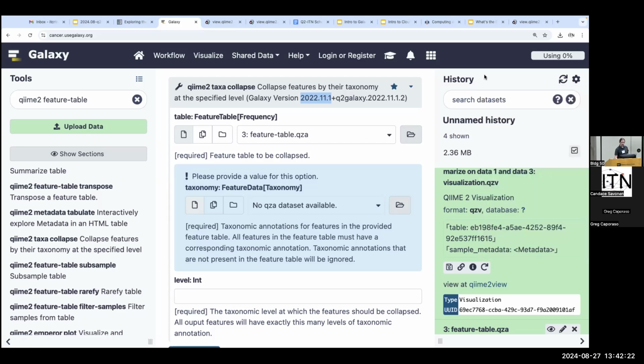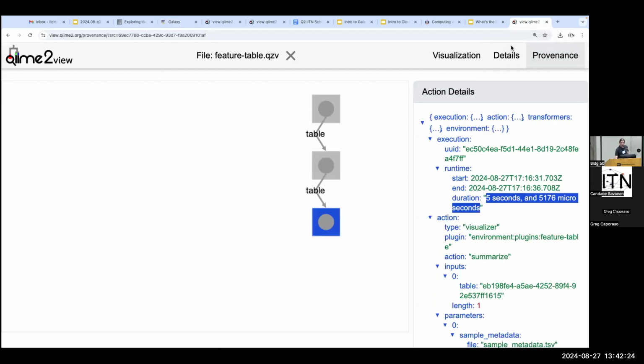The way that we typically do this with QIIME2 is we have another tool. We're going to show this to you at the end of the day on Friday. We have a tool that's built into QIIME that enables you to generate what we call a reproducibility supplement. It's basically going to create a zip file for you that has all of the commands that you ran. Generally you would produce one of these reproducibility supplements on some folder that has your final results in it.